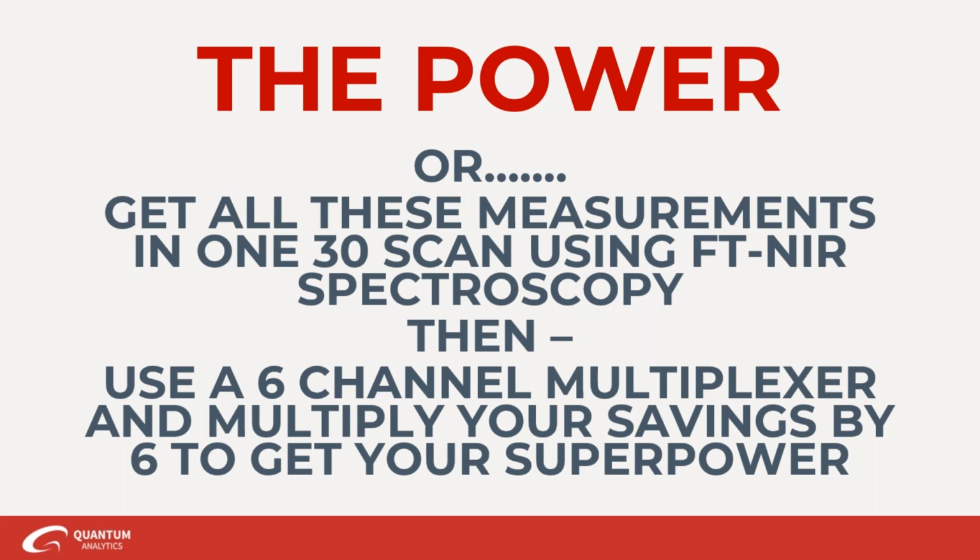And the process that usually happens is, once you have one of these set up and you're scanning and getting your predicted values, from time to time you pull out samples and you go do the reference method. And then you take a look and you say, okay, what did the near-infrared predict? And what is the actual reference method? And you can compare that to validate your model, but then you can also take that sample and add it into your model.